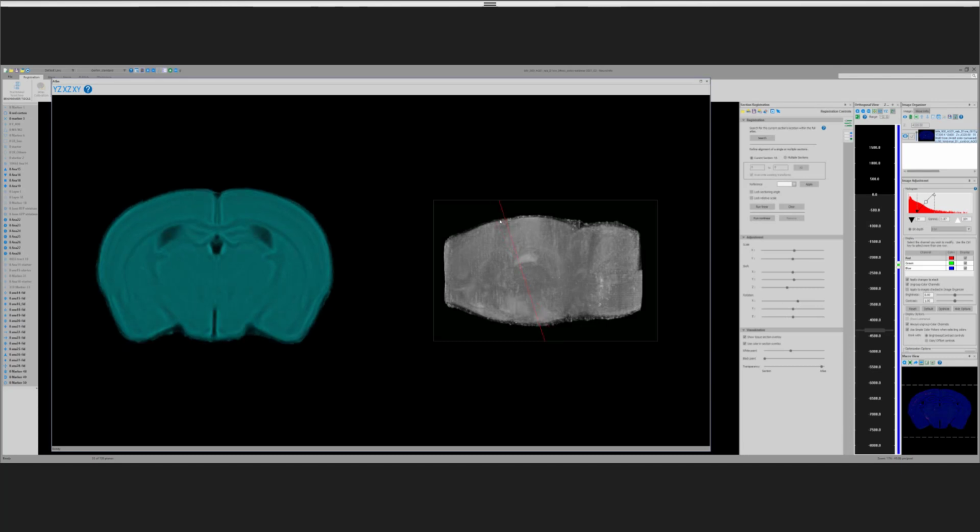What this is doing is cutting through the hippocampus at this level, and the optic fiber tracts are at this level. To find that space within the Allen, we have to make this shift in the x-axis or rotate in the x-axis.